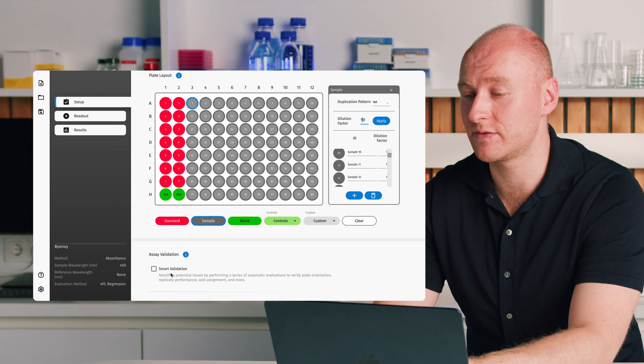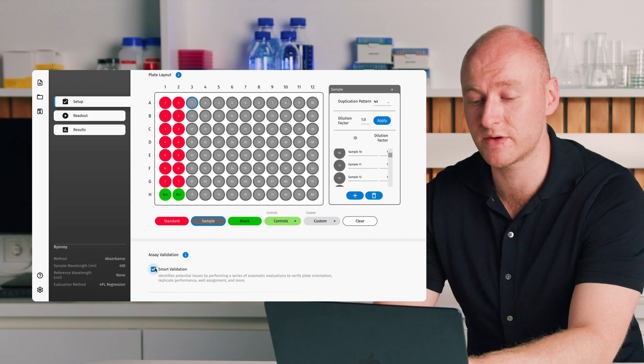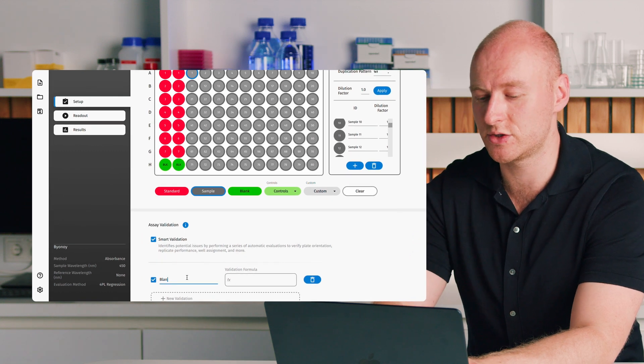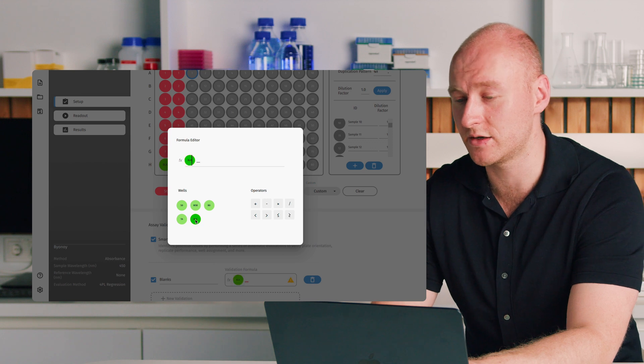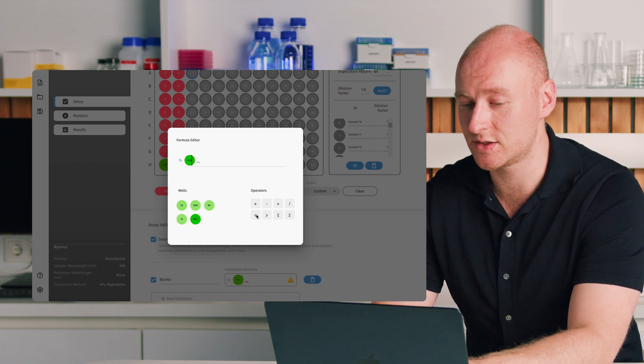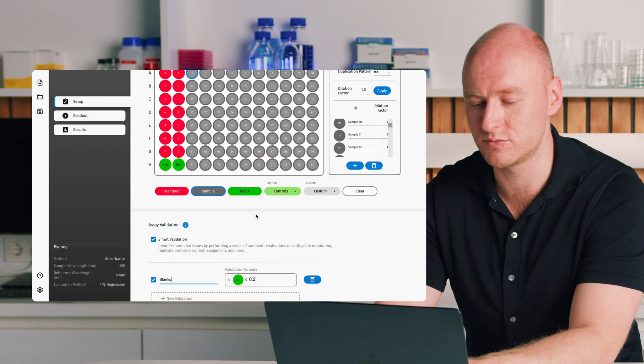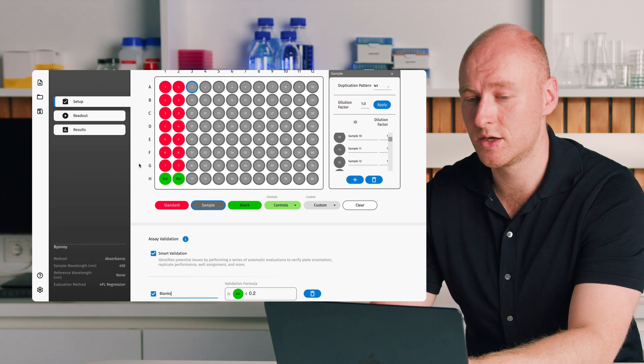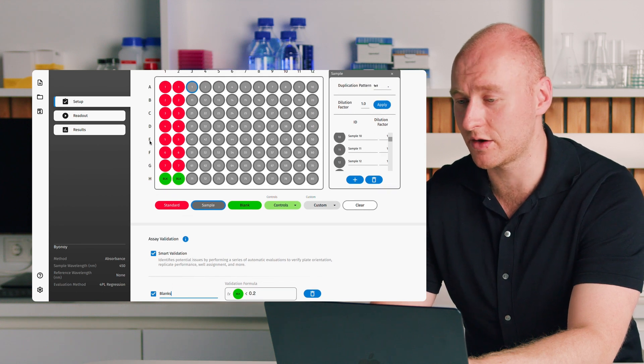We then have our assay validation, featuring smart validation — a Bionoy feature that runs checks on your assay including checking percent CVs between replicates to ensure correct pipetting. You also have the option to add custom validation. For example, to ensure blanks aren't too high, we can add a validation formula saying the value of the blanks must be less than 0.20 OD — press enter and that will run automatically.